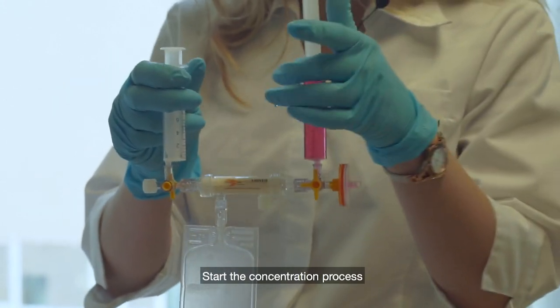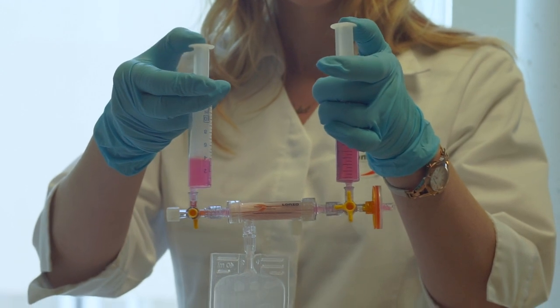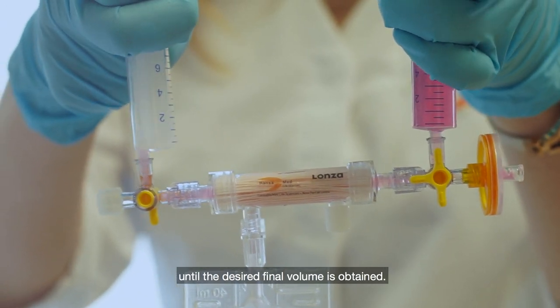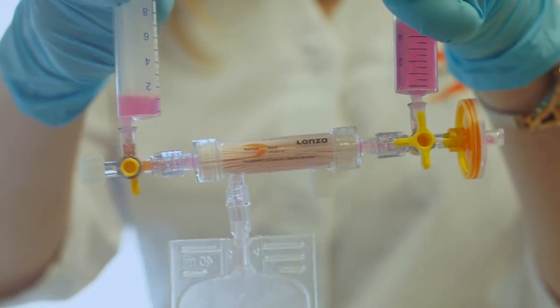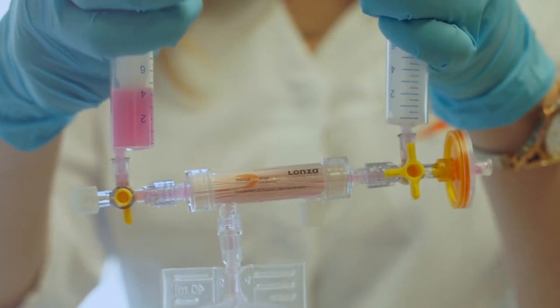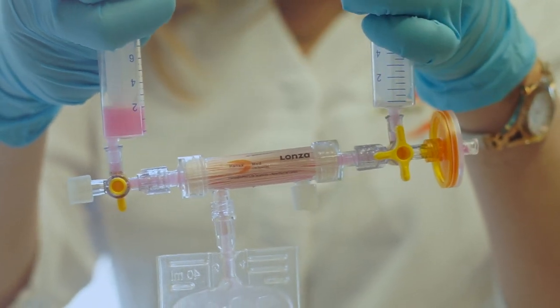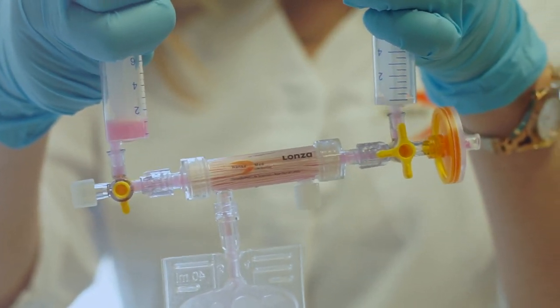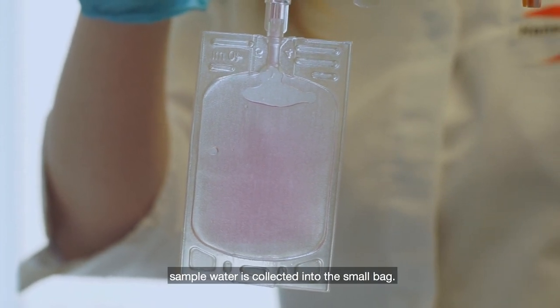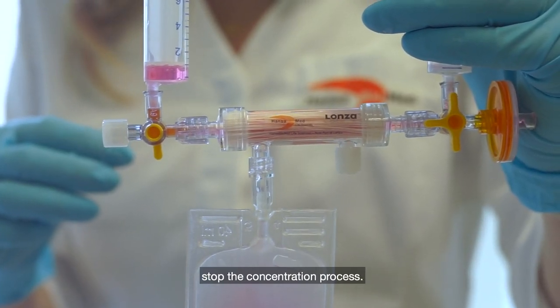Start the concentration process by pushing two syringes upwards and downwards. Continue the concentration process until the desired final volume is obtained. During the concentration process, sample water is collected in the waste. When the desired final volume is obtained, stop the concentration process.